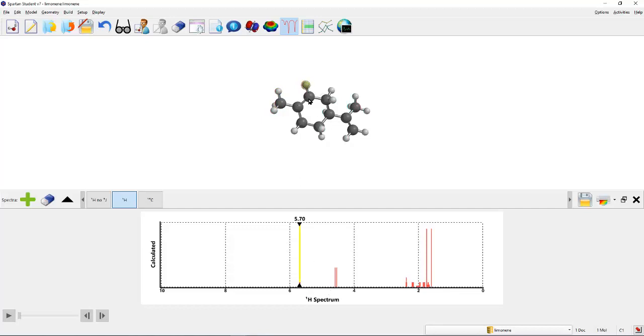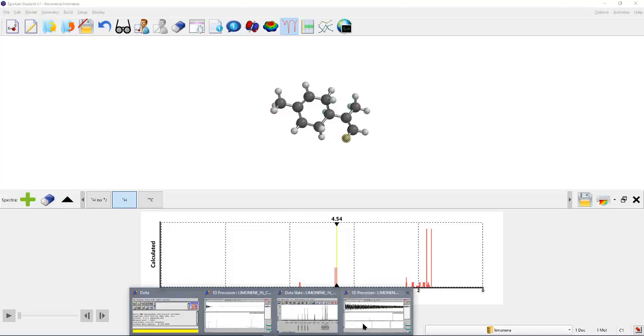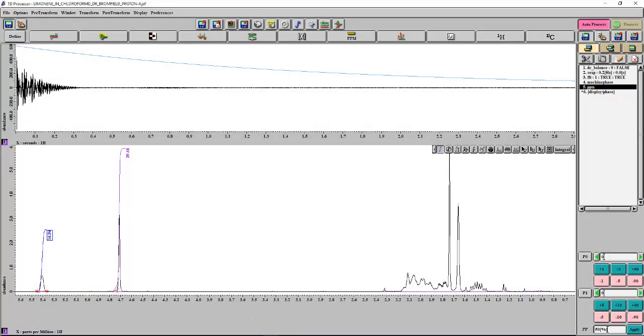So this is this hydrogen coming off at 5 point something. Then you have these protons coming off here. They're showing it like it's a doublet because these are technically diastereotopic, but they're so close to each other that they just look like a broadened peak. So it's saying that this is the lower ppm value one. If I go to my proton NMR, the one that's that lower number around 4, we know it should integrate for 2. So I can set it to 2.